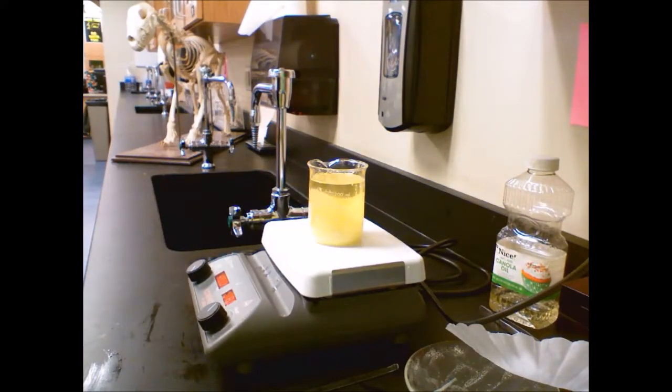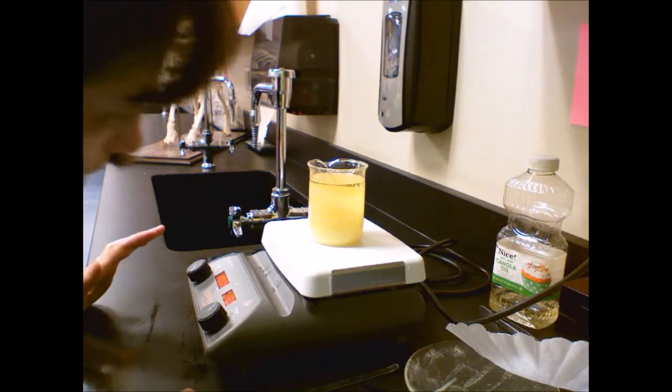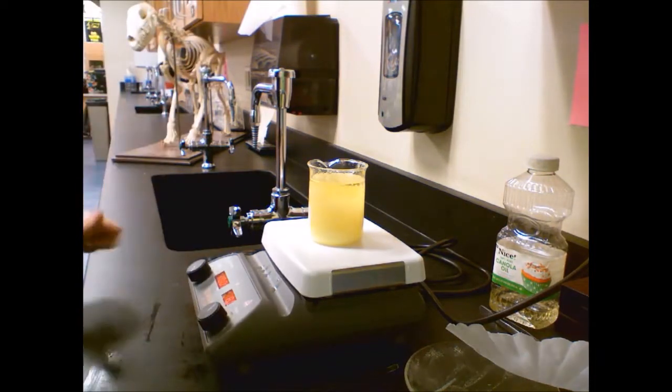And you'll notice in a second that the sulfur is going to get real cloudy. And the cloudiness was an issue I ran into over and over again when I was trying. You can see it has become cloudy. The top bitsy is still clear, but the top bitsy was actually a saturated solution of oil and sulfur at room temperature. So that is the reason for the difference in color. I am sorry for swinging you all over the place.